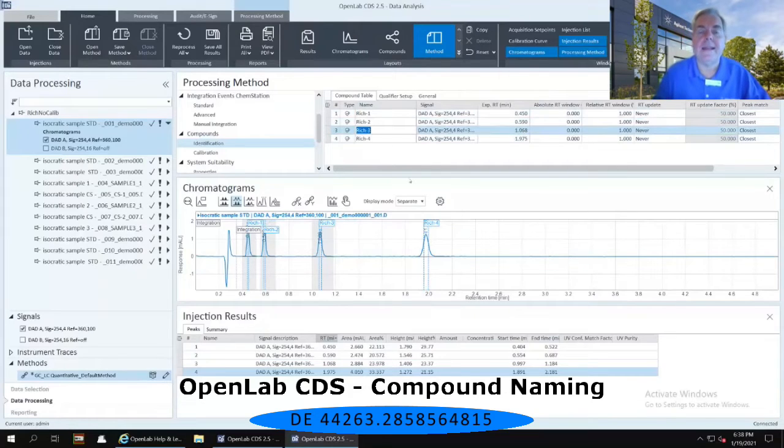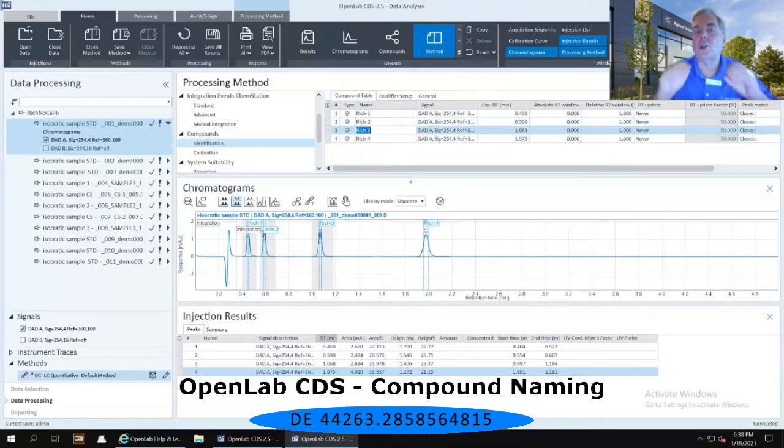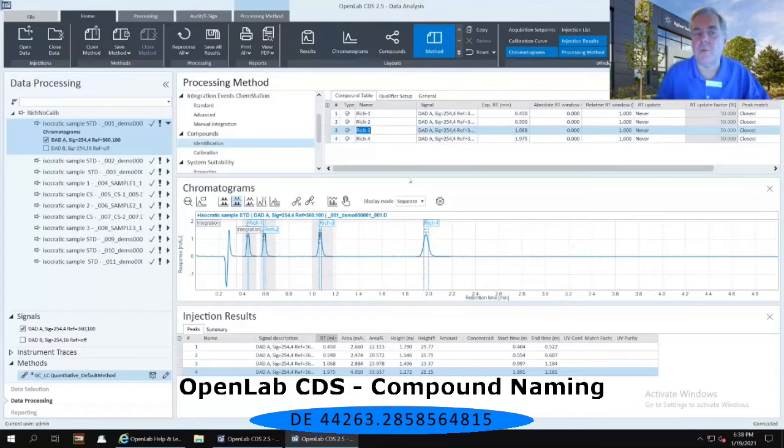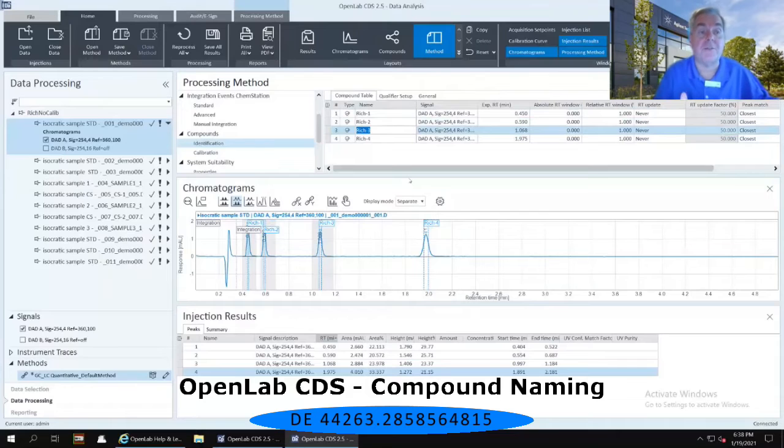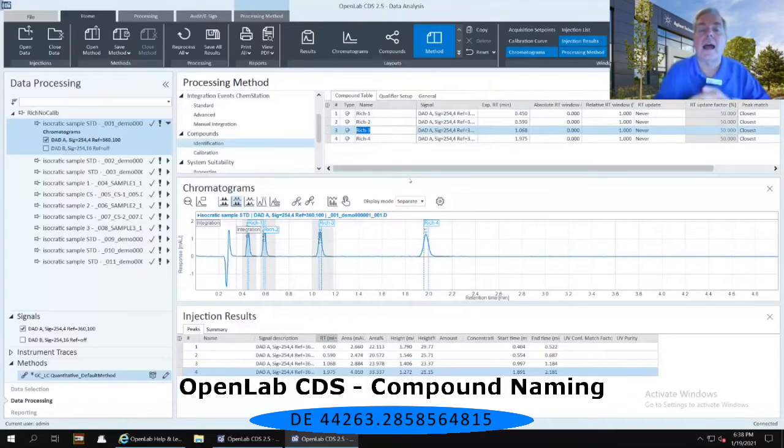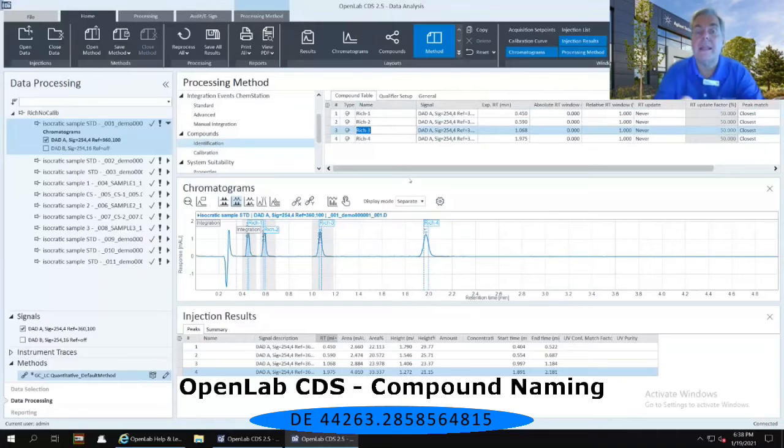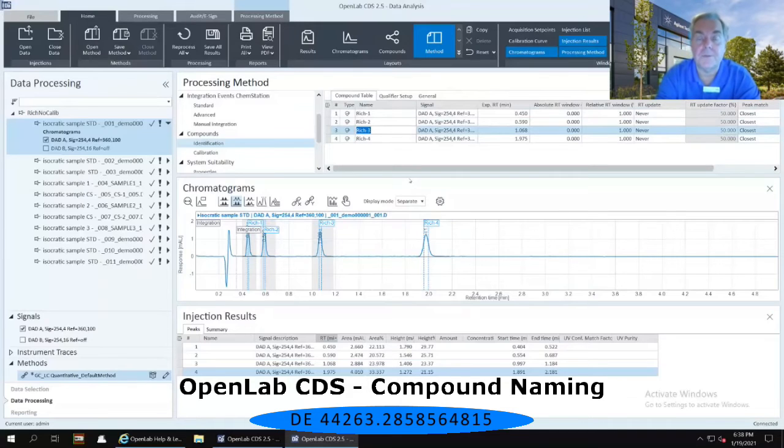Now again, making sure that our lowest-level standard is the one that we have highlighted on the left-hand side, which should be the very first injection of that Rich-Nocal set of results. I have now named each one of my compounds.